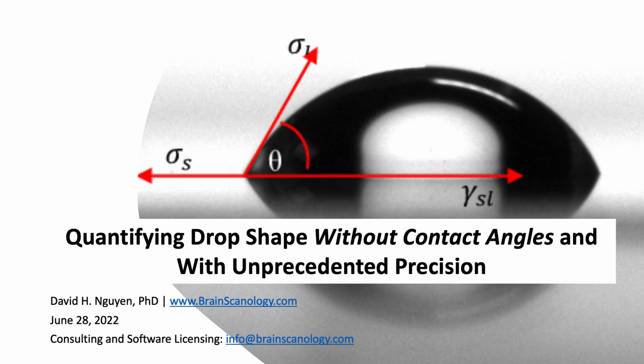So in conclusion, I hope to have convinced you that the LCPC transform is poised to revolutionize how we measure drop shapes and all the applications that rely on drop shape analysis, such as waterproofing, coatings, pharmaceutical coatings, liquid-liquid interactions, liquid powder interactions, and we're real excited about all the potential applications.